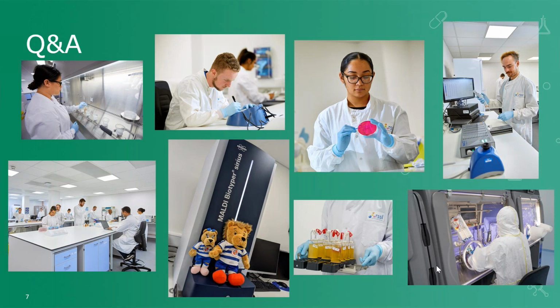The time of the media fill should simulate the maximum production time, and within that there should be a reasonable number of filled units that can replicate the different stages, and where there's need for any manipulations or interventions, that these are adequately covered, and also allowing all of the personnel who will be involved in the process to follow the process.